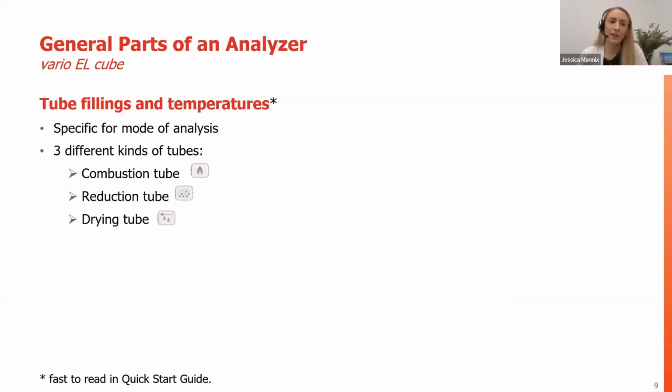What does the combustion tube look like? In addition to the combustion tube, with CHNS analysis, we're also typically looking at a reduction tube in order to manipulate those compounds, turn them over into uniform compounds in order to adequately separate them. When we're looking at pyrolysis and sometimes TOC analysis, we'll just have one reaction tube. And then sometimes when we're looking at larger sample sizes on a macro size analyzer, we may have a third tube to ensure complete conversion of our compounds.